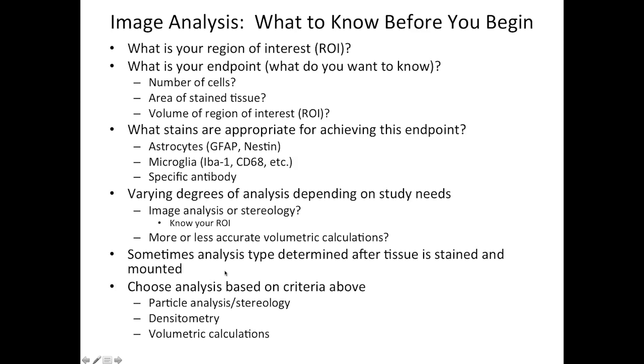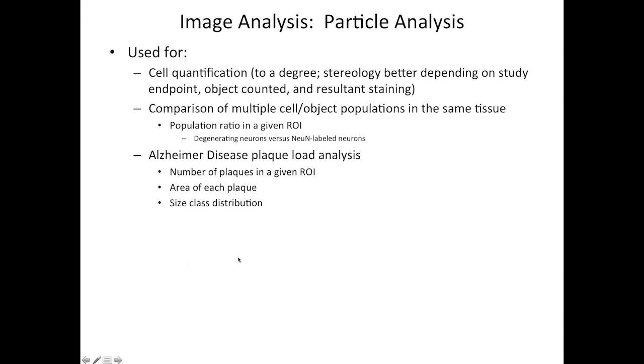So let's move into some of these types of analyses. The first one we're going to talk about is particle analysis. So what is this used for? And I'll go back again, it's used for cell quantification to a degree. Like I mentioned before, stereology can be better depending on what the study endpoint is, what objects you're counting, and what the staining looks like.